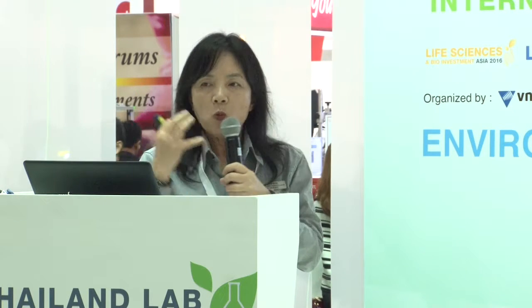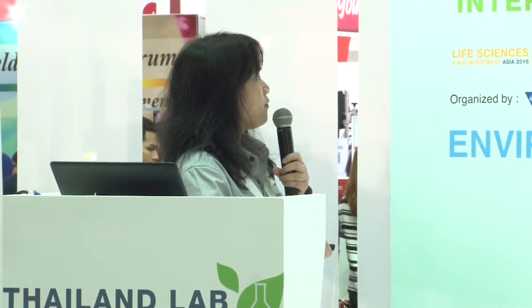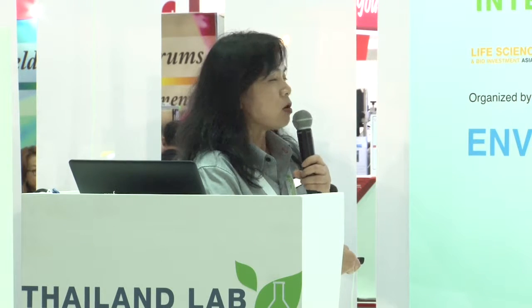All right. But what happens if the element only has one isotope, like arsenic? Arsenic 75 only has one isotope. And for arsenic 75, there's argon 40 and chlorine 35. If my sample is digested in HCl, then I would experience these interferences. Then what should I do? Right? So that means I need to look for a way to minimize and remove my interferences.